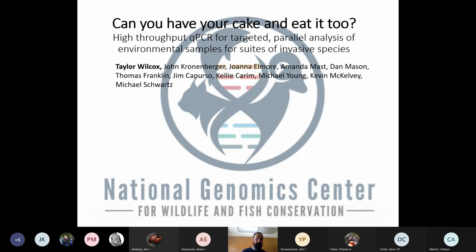But yeah, as Adam introduced me, I work at the National Genomic Center for Wildlife and Fish Conservation, so that's nested within the research branch of the U.S. Forest Service. And today I'm going to talk about high throughput qPCR for targeted and parallel analysis of environmental samples, specifically focusing on invasive species.